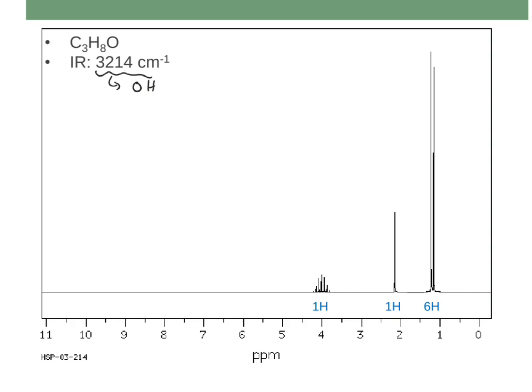So if you take a look at this, I've got C3H8O. I can really only make two different alcohols here. I can either make the isopropyl alcohol, or 2-propanol, or I can make 1-propanol. Those are the only two options I can make. I have no degrees of unsaturation, so I know there's no double bonds or rings. And really the only two ways I can assemble 3 carbons, 8 hydrogens, and 1 oxygen are these two ways.